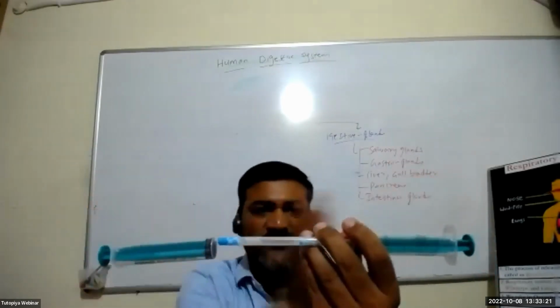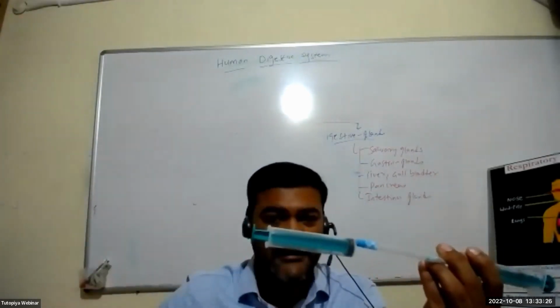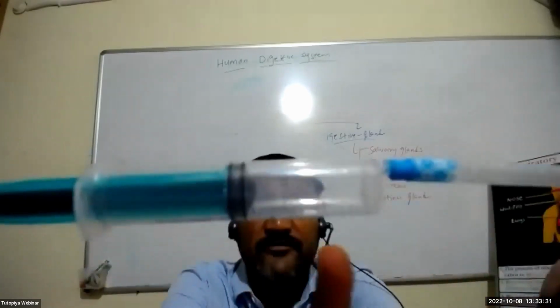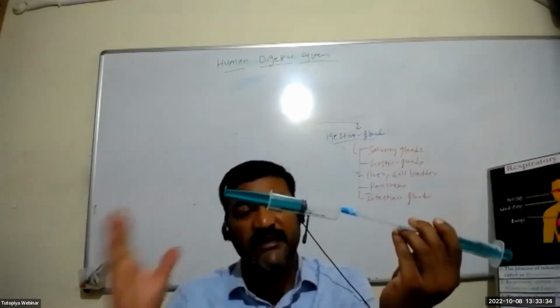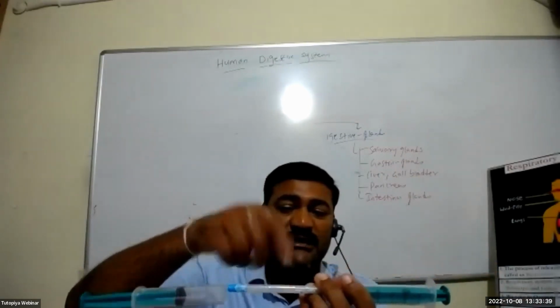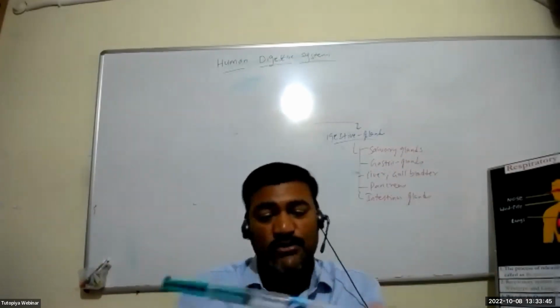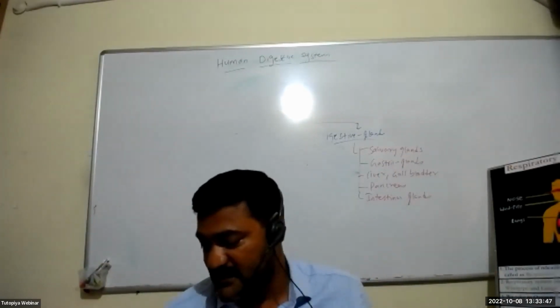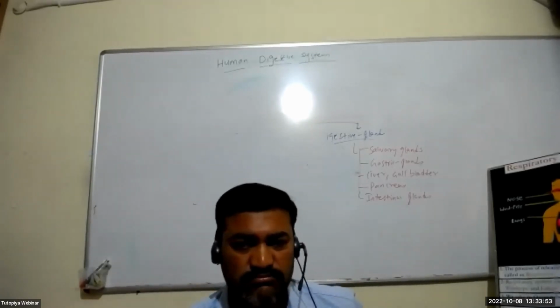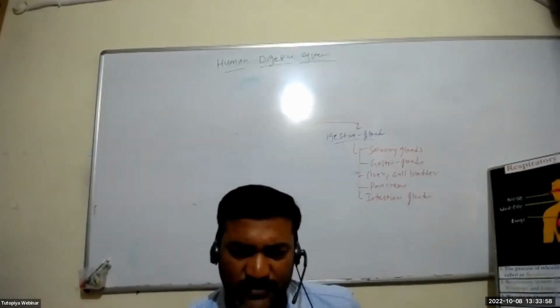So keep swapping this air left to right, right to left for some time until this entire copper turns into black copper oxide. And finally, after doing that, if you check here, the volume of air left will be only 78 to 79 ml. What happened to the remaining 21 to 22 ml? It has reacted with copper, and that 21 to 22 ml is not air, it's oxygen. So this proves that air has about 21% of oxygen.